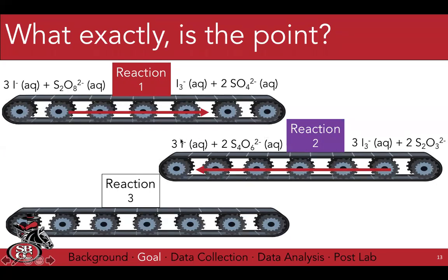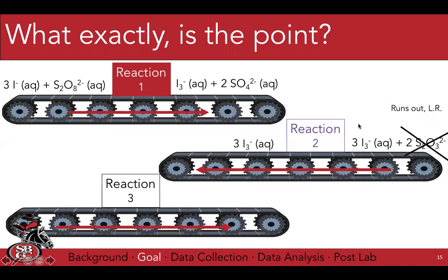I minus. And because we're making I minus, reaction 3 doesn't work. So it's coming down over to here, moving through reaction 3, but I minus and starch makes no colored reaction. So again, we're going down here and then down here and through here, but no reaction because reaction 2 is eating up all of the triiodide.